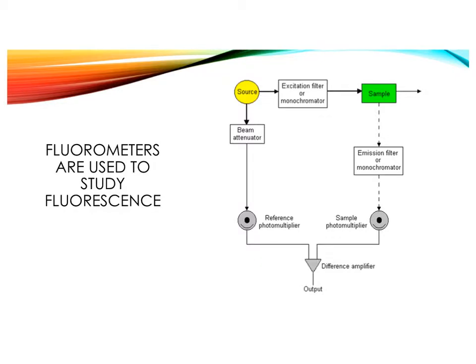You will then use a fluorimeter to determine the fluorescence spectrum of your sample. A fluorimeter uses a reference beam to measure the ratio of fluorescence emission intensity to excitation intensity. Why is the emission filter and detector at a 90-degree angle from the source? Well, the fluorescence instruments are designed this way to detect photons emitted from the sample without the photon pollution or noise from the source. This is commonly known as increasing the signal-to-noise ratio.